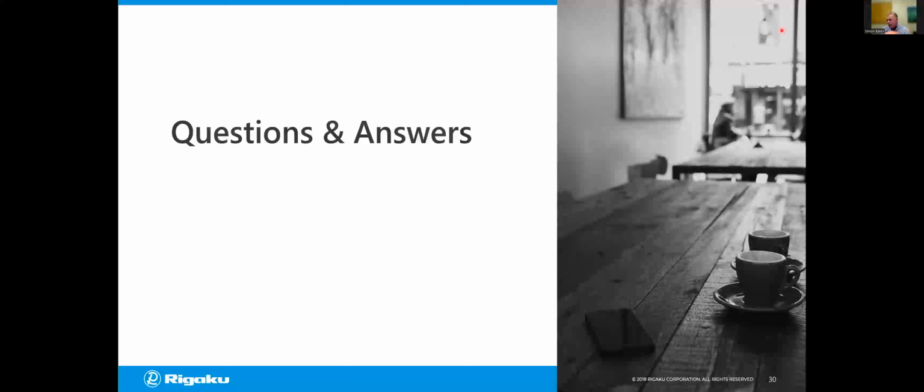All they do is just chop off the crystalline peak, so you can apply Bragg's law, which is a gross approximation anyway, to the data. And so absolutely do not use standard profile fitting approaches to determining a background on your sample, because it'll skew the analysis completely. There's a lot of things that are called background that are actually real fingerprints and signal from the material. You're fundamentally changing the way people have to think about background correction, Simon. Totally, yeah. Total diffraction is the future.